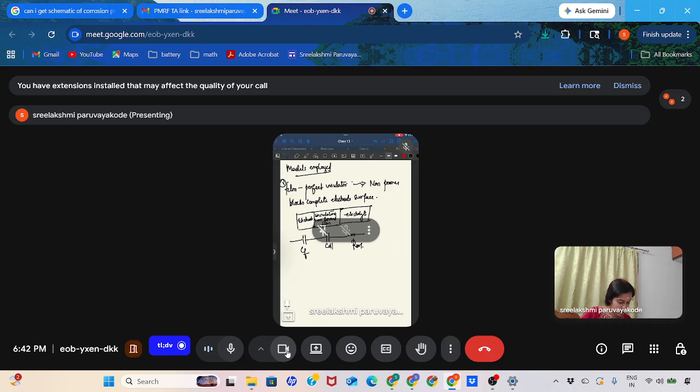So if you see, there are two capacitors and one solution resistance. This solution resistance is a simple point. Now, how will the double layer capacitance be? It is kind of blocking, right? So it's going to be a single vertical line, which shows that it is blocking. I cannot say completely; initially it can be something like this probably, and then it becomes a straight line, especially at the low frequency regime.